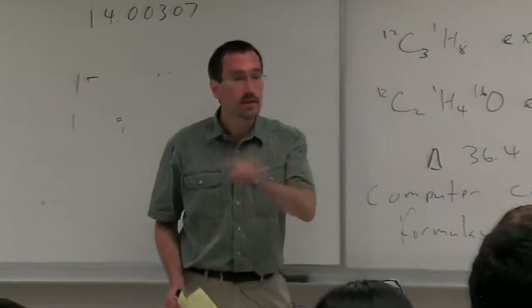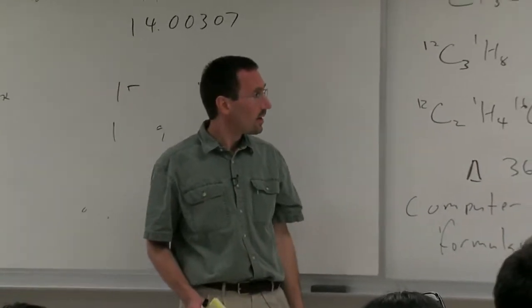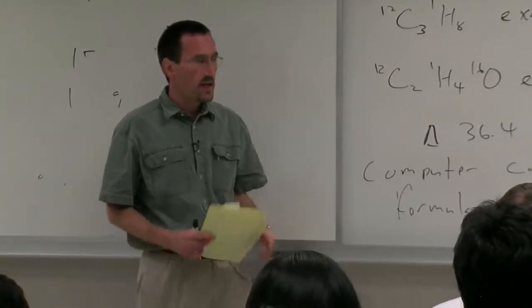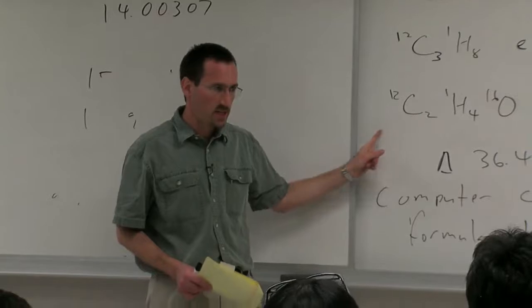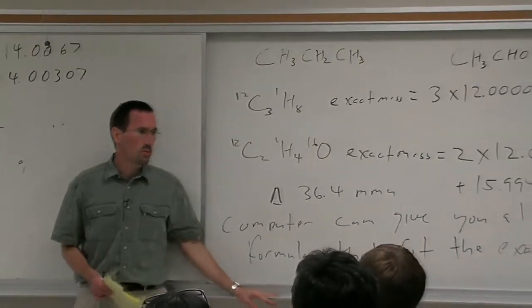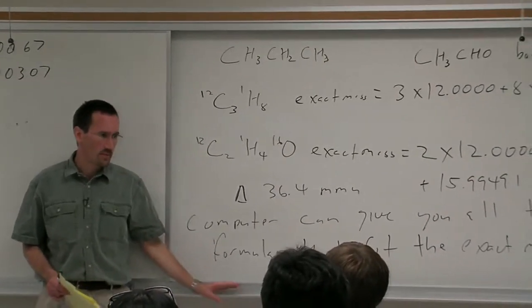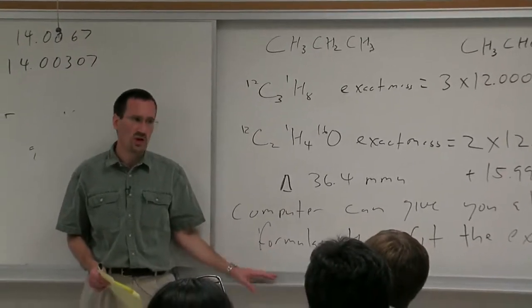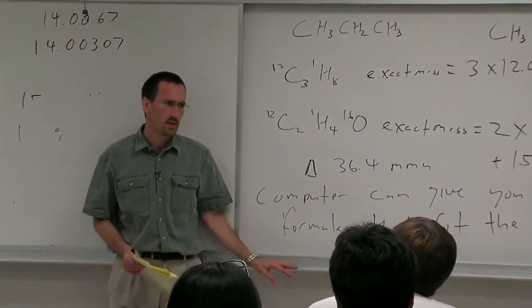Oh, I was going to say, this is only if you're looking at the parent peak, right? This is only if you're looking at the parent peak. And with EI mass spec, sometimes John Greaves will come back and say this is for a fragment, but it's a logical fragment of your molecule. Whereas with soft ionization, you usually can get it.